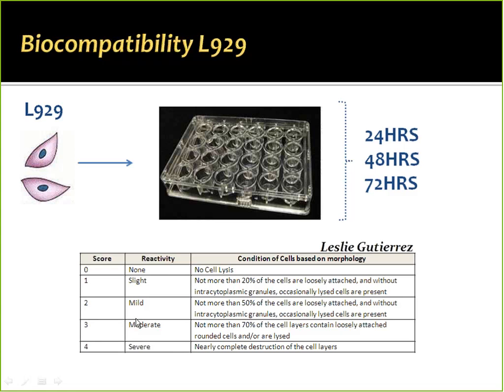And in many cases, when I was doing this in the laboratory with my coworkers, I would give something, depending on my mood, a 2, while the other person might give it a 3, and it was very difficult for us to really match our reactivity findings. And so we decided for that reason we wanted a more objective test, and we started using the xCELLigence side by side with our own visual experiment.